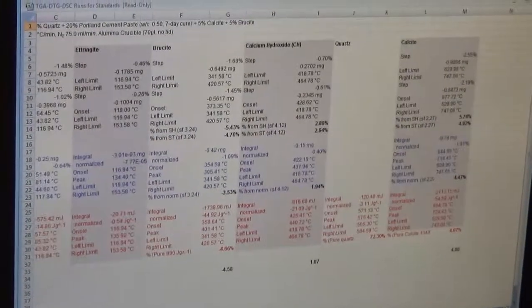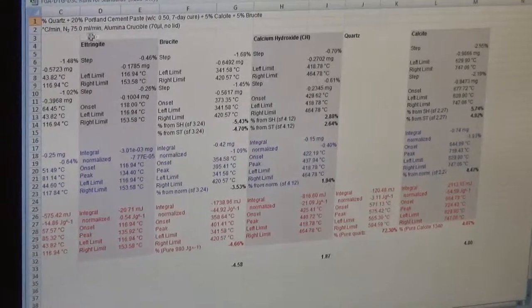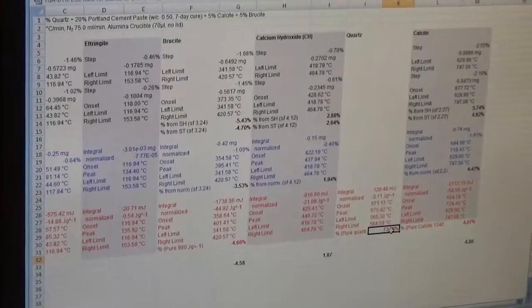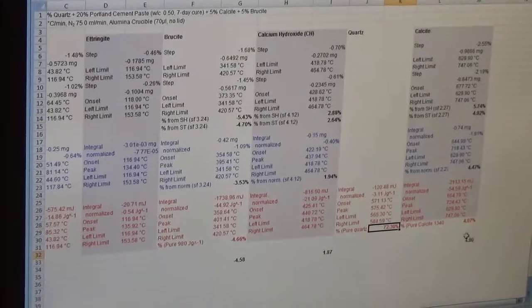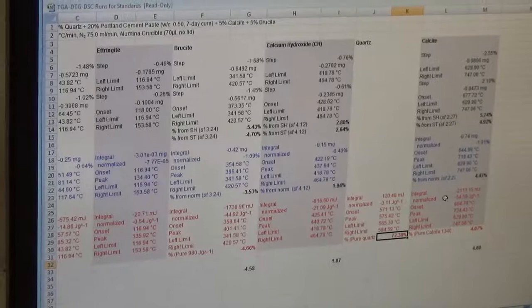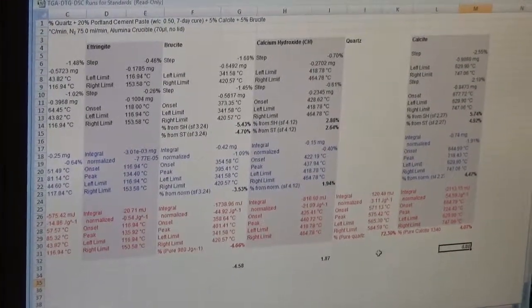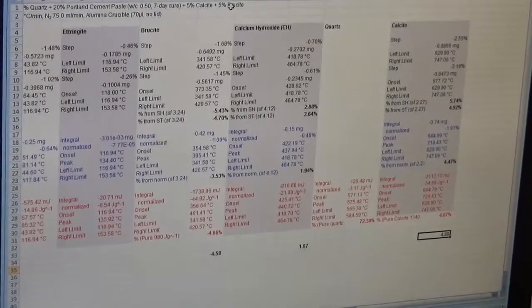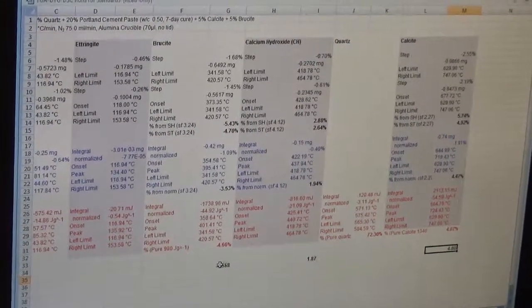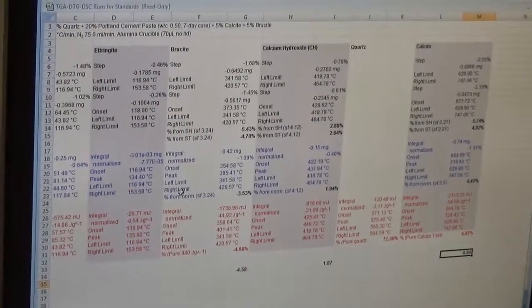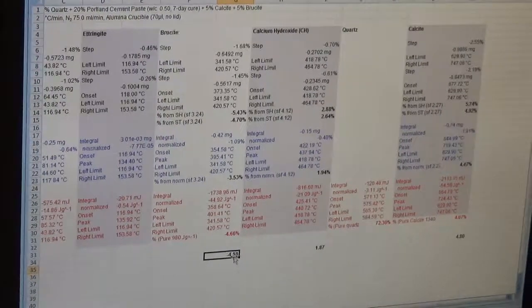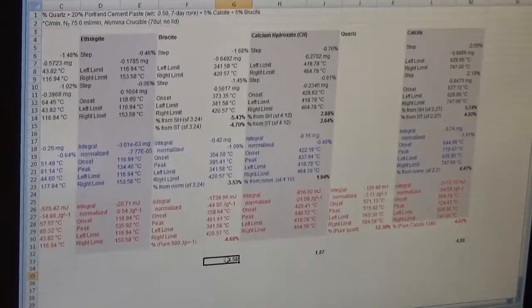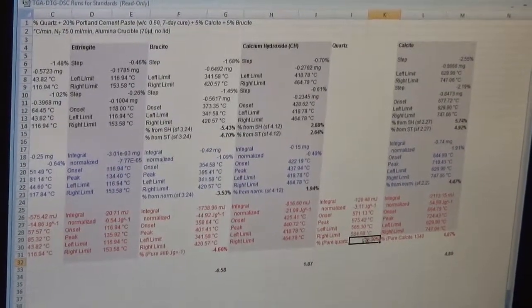To show how I calculate the individual minerals: I had 70% quartz; DSC gave 72.3% quartz. I added 5% calcite; the average calcite from TGA, DTG, and DSC came to 4.8 — a pretty good match to my actual amount added. Brucite: I added 5% brucite, and the average brucite content determined from TGA, DTG, and DSC came to 4.58. So I got a good recovery — 4.6% brucite, 4.8% calcite, and about 72% quartz.